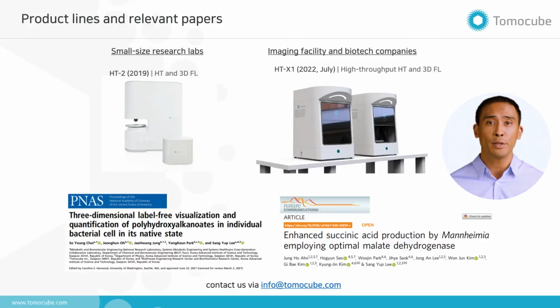Both HT2H and HTX1 provide a feature for measuring 3D deconvolution fluorescence imaging with 3-channel overlay and an incubator for long-term measurements. There are interesting scientific papers produced using HT, particularly for the field of microbiology.